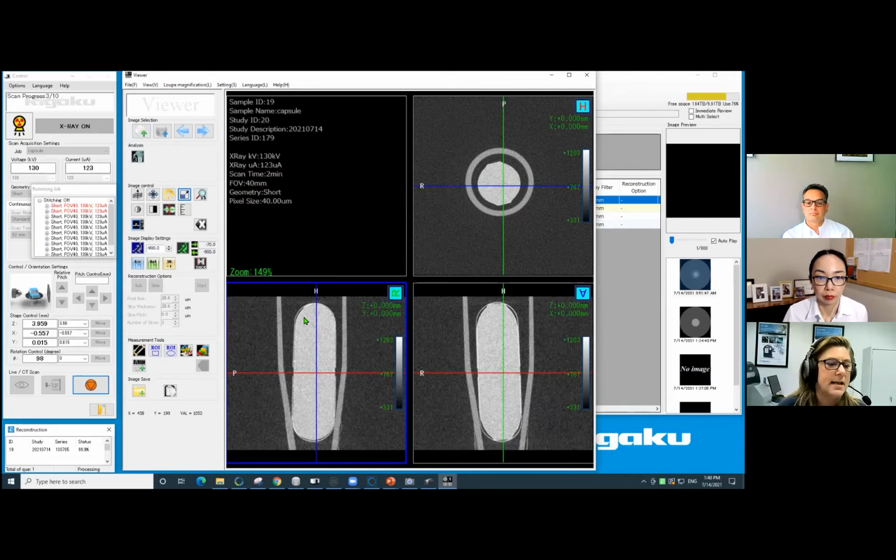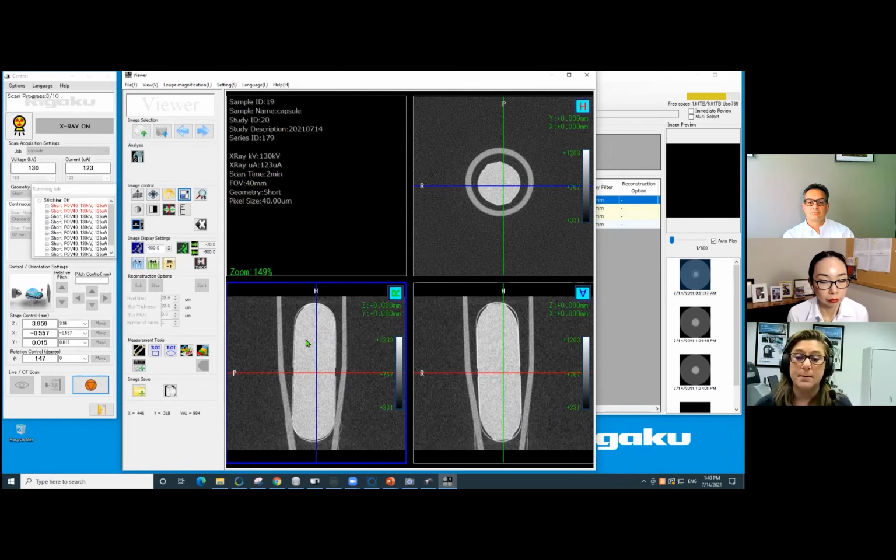And so inside the pill, you see its active ingredient with some sort of filler material. And it's surrounded by a very thin coat, which you can barely see, that covers the entire pill. And then on top of that, there are caps that are placed over the ends of the pill. So you'll see one cap on the top and one cap on the bottom.